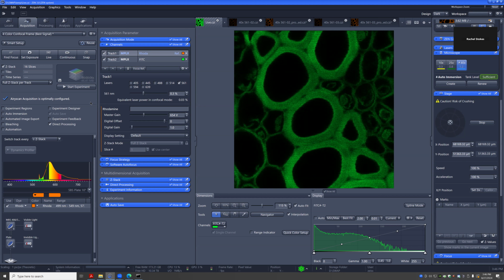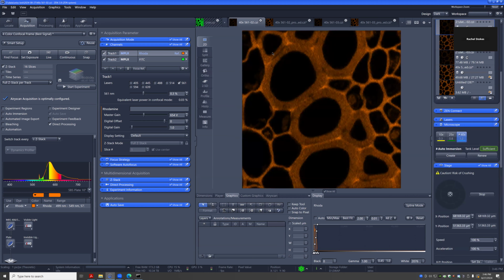And on the Zeiss system, you have to go in and save each image one by one. They're not automatic. We have the autosave, right? If you don't have the autosave on, it'll ask you. On the older systems, if you messed up and didn't save and closed, it would be gone, or if you did live it would override another one. It doesn't really do that anymore.